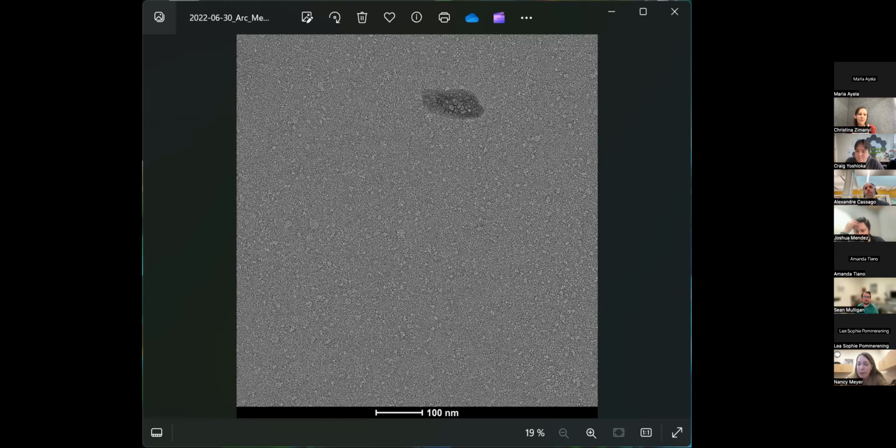If the grids are already made and that's what you have on hand, then you're stuck with tilting as a brute force measure at the moment. I was going to say, if you have the option, maybe you could use a different way of preparing the grids, maybe using chameleon. If not, tilting might be the way to go, and you can potentially recover some of the signal you lose by running into thicker ice, and it may give you views that you don't have.